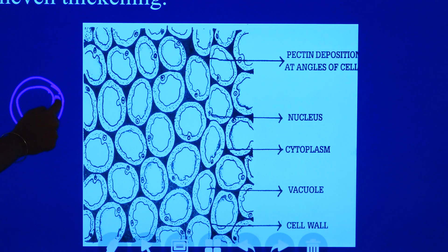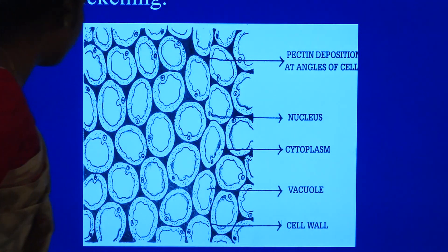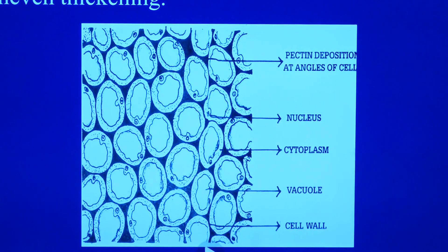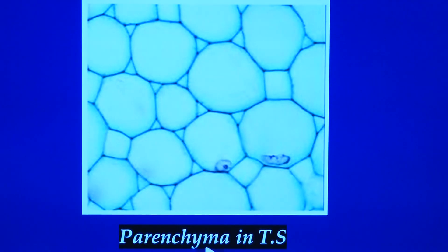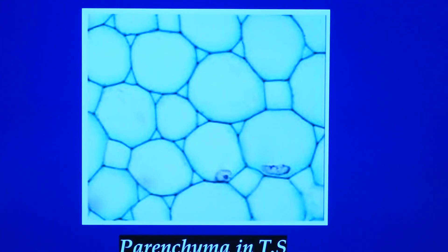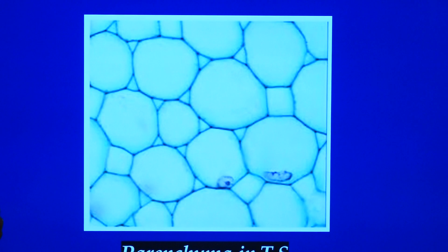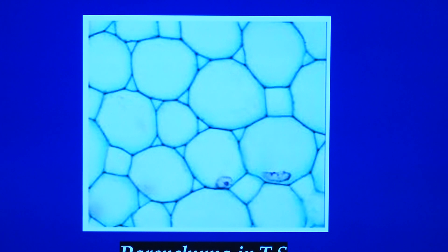At the periphery we will be seeing the nucleus, along with that we see the cytoplasm. In the middle, the cavity again is the vacuole. So protoplasm includes these components. The major part of the plant body is made up of parenchyma, and the main function of parenchyma is mainly for storage. This is the microscopic view of a parenchyma tissue.